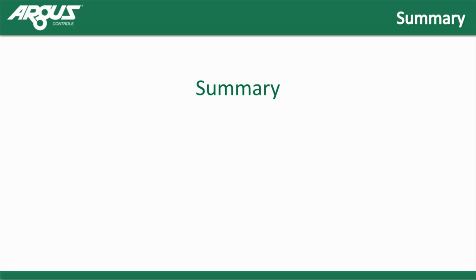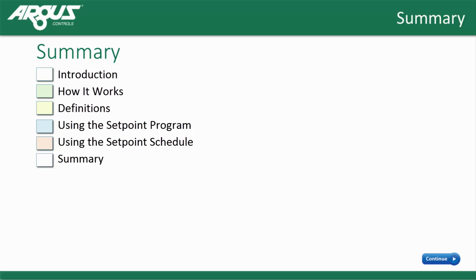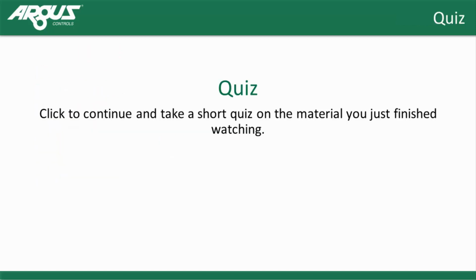Summary. The topics we've covered today include introduction, how it works, definitions, using the Setpoint program, using the Setpoint schedule, summary, and a short quiz. Next is a short quiz on the concepts you've learned today.